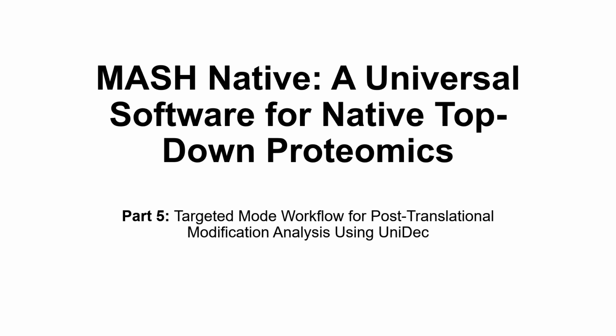It is important to note that this video tutorial is intended to be used in parallel with the step-by-step instructions found in the Getting Started guide, which is located in the Documents folder in your MASH native software package. In this video tutorial, we will walk through Tutorial 5, Post-Translational Modification Analysis using UniDec within MASH native. Please pause this video and download the necessary data file to your computer and save it to a new local folder as described in the Getting Started guide, if you have not done so already.